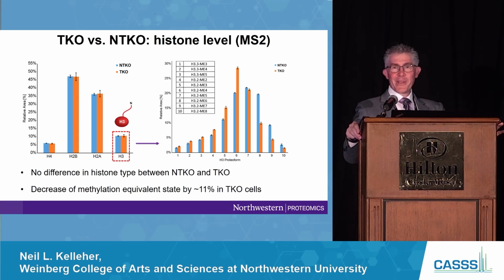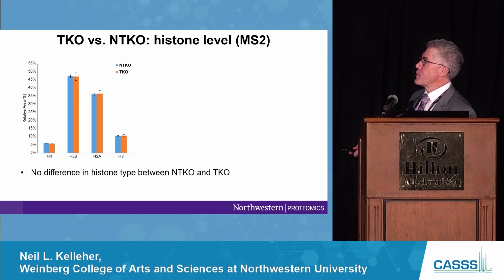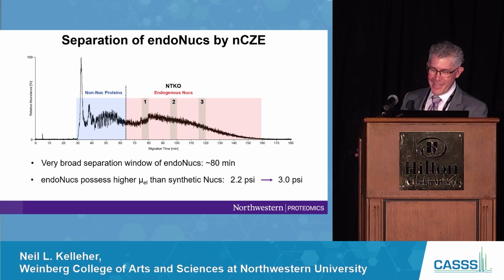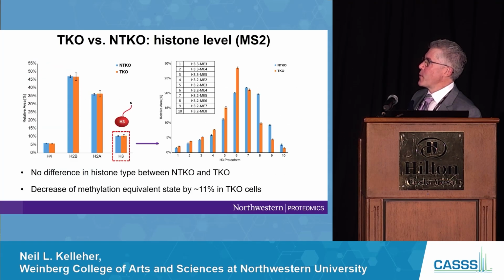That was really fast, so if you want to back up. But it just really shows the power of the separation power. Sending it a mixture like this was a little bit of a crazy experiment, but Kevin got it to work. It didn't work out the way we wanted, but we were able to get out histone proteoforms and even fragment some of these proteoforms in the MS3 event.